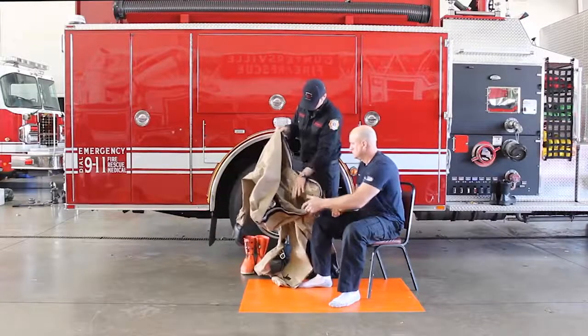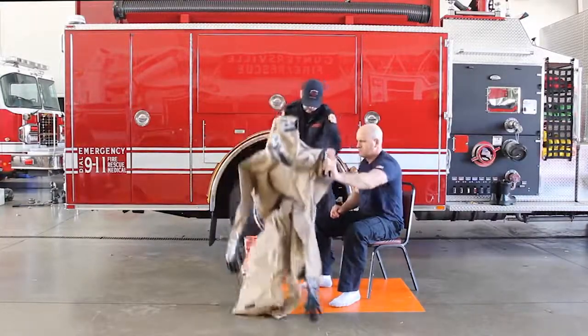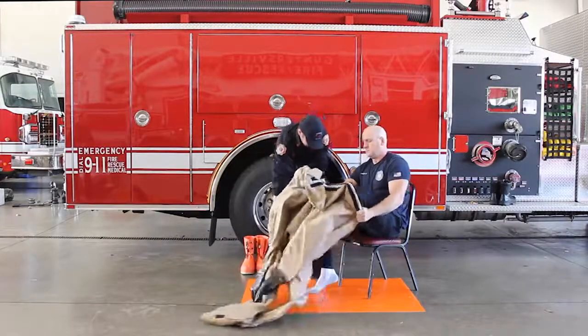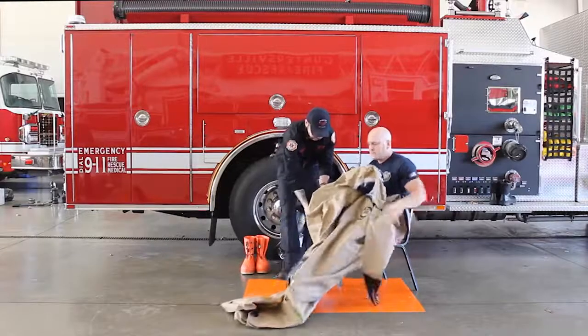While seated, insert feet into garment legs and down into sock boots. Stretch legs out to maximum extension while pulling garment up around hips.